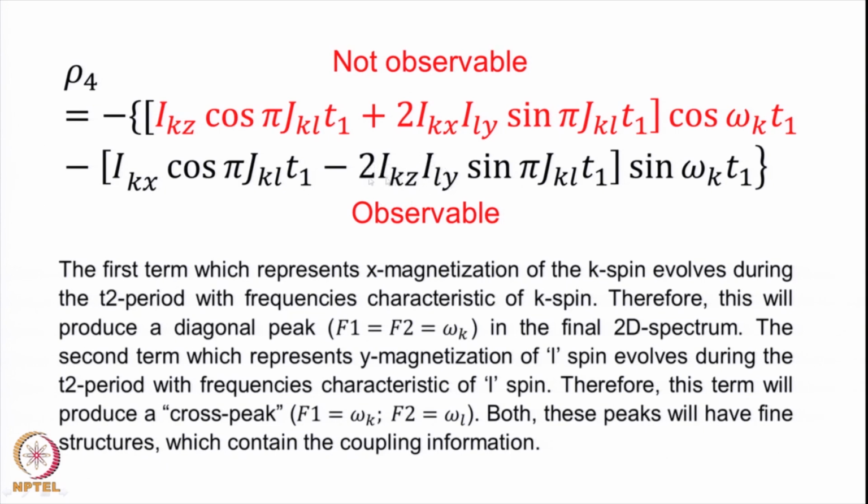So from the K magnetization we have generated L magnetization here, so this represents a coherence transfer. Both these are single quantum terms, although this is antiphase, this is in phase, whereas this one is Z magnetization and this is multiple quantum transitions here.